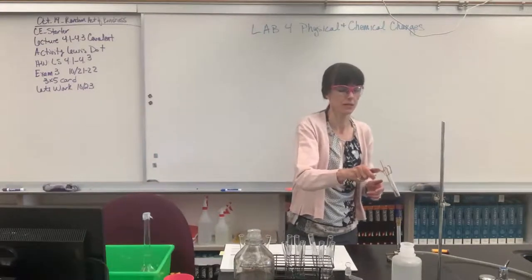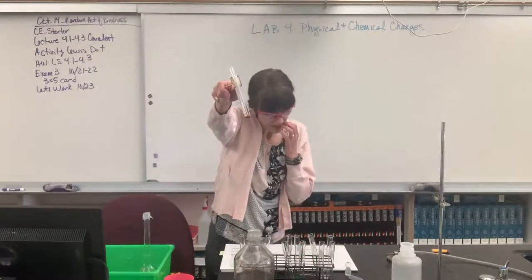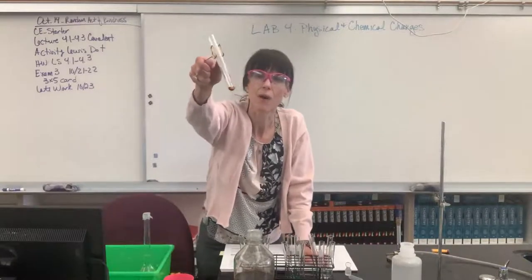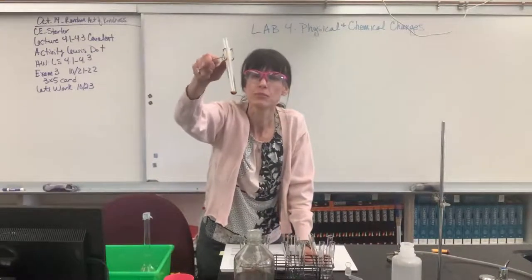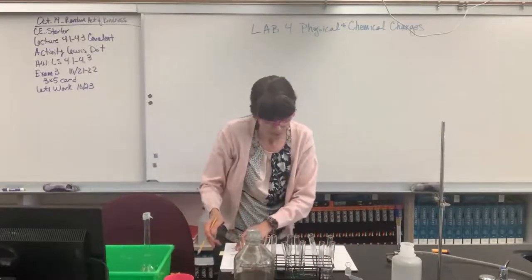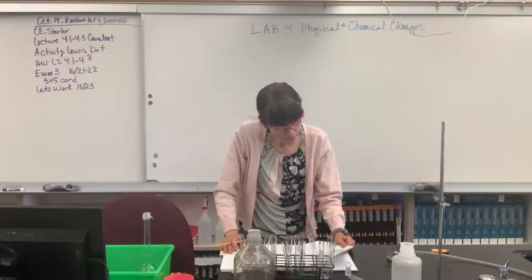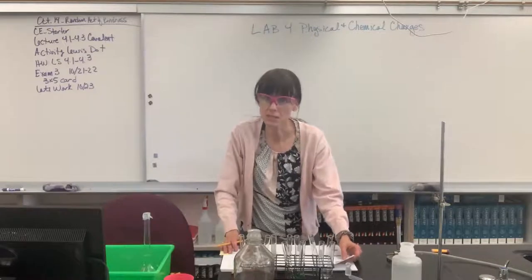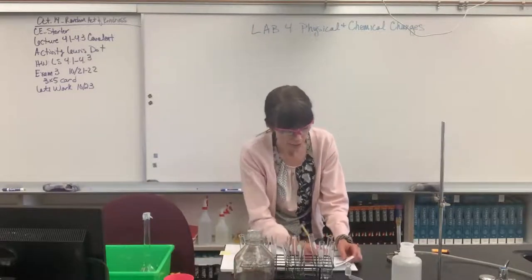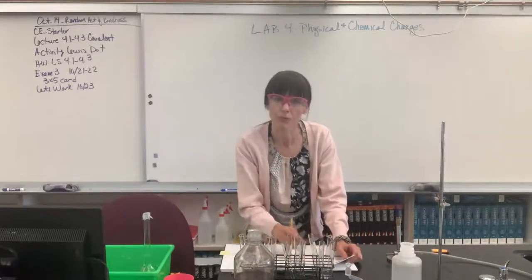Oh, wow, way interesting. It turned red. It's actually the same color as when we added the ammonium thiocyanate to it. Wow. So another deep red color. Let's go ahead and record that. So if we come back, this is going to be the melted sample where it says solution color. The melted sample, right down red. So solution color, just right across from that melted sample, put red. Okay.